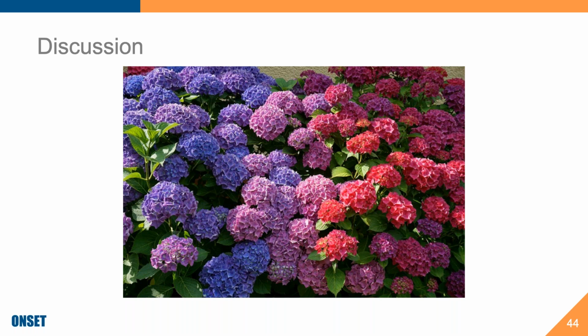And when I'm out in the field, if I'm just using vinegar diluted with water, then I don't know if I always hit 15 minutes, but what I'll tend to do, because I have many loggers out there, is I'll grab the pH logger first, download the data, clean it, and then pop it into storage solution while I'm doing everything else. And then the last thing I'll do is calibrate the pH electrode before redeploying.